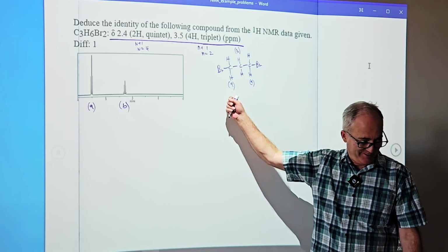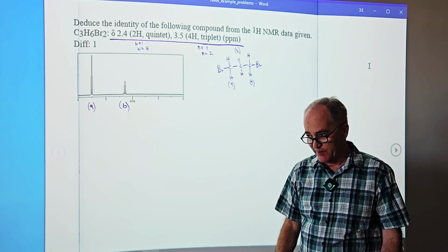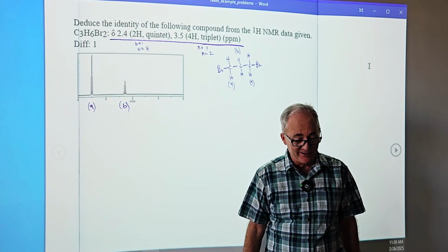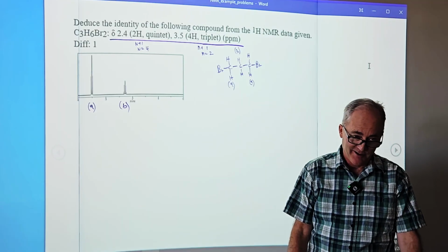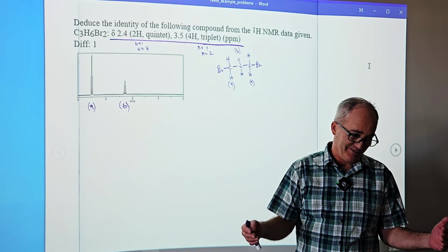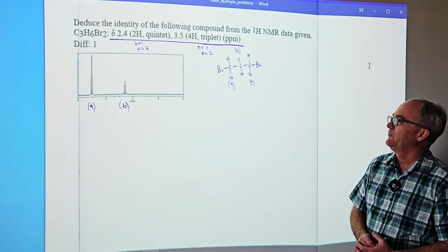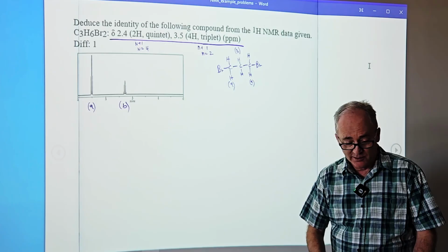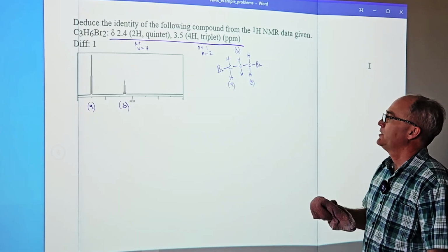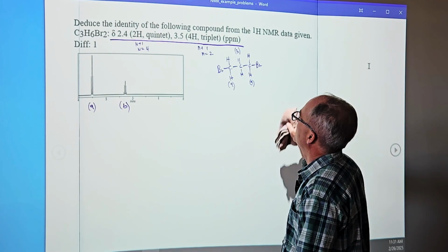What do you think? So a lot of these, maybe it's why students have difficult times, and maybe that's why it's a beautiful thing intellectually, like a lot of chemistry is. You don't know the answer till you try and solve it. And a lot of people don't like that uncomfortable feeling of looking at something and having no idea, but as you work along, it should become more obvious.